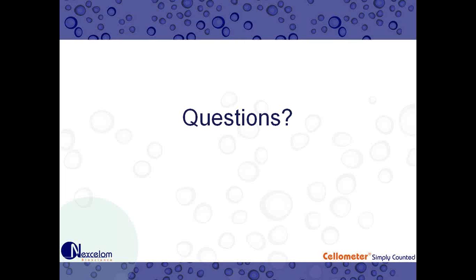We have another question from Debbie, and Debbie is asking, how do you diminish halos around the cells? Fluorescent halos? Well, you can reduce your exposure time, for one. If you see a halo blooming, that's a clear sign that your exposure is too bright. So reduce your exposure. And also your focus is a very important part of it. You're looking for clear defined membranes and bright white centers.